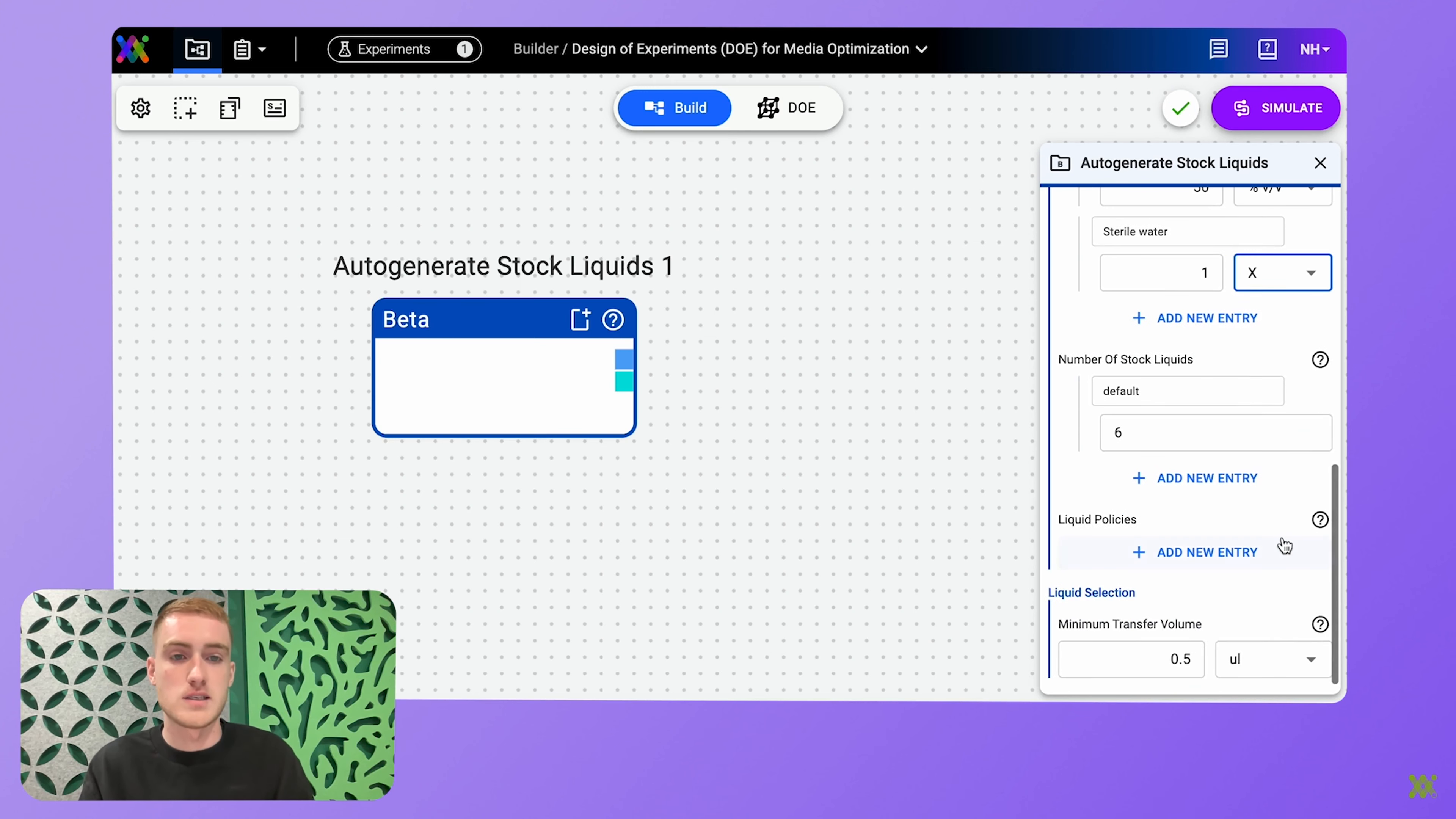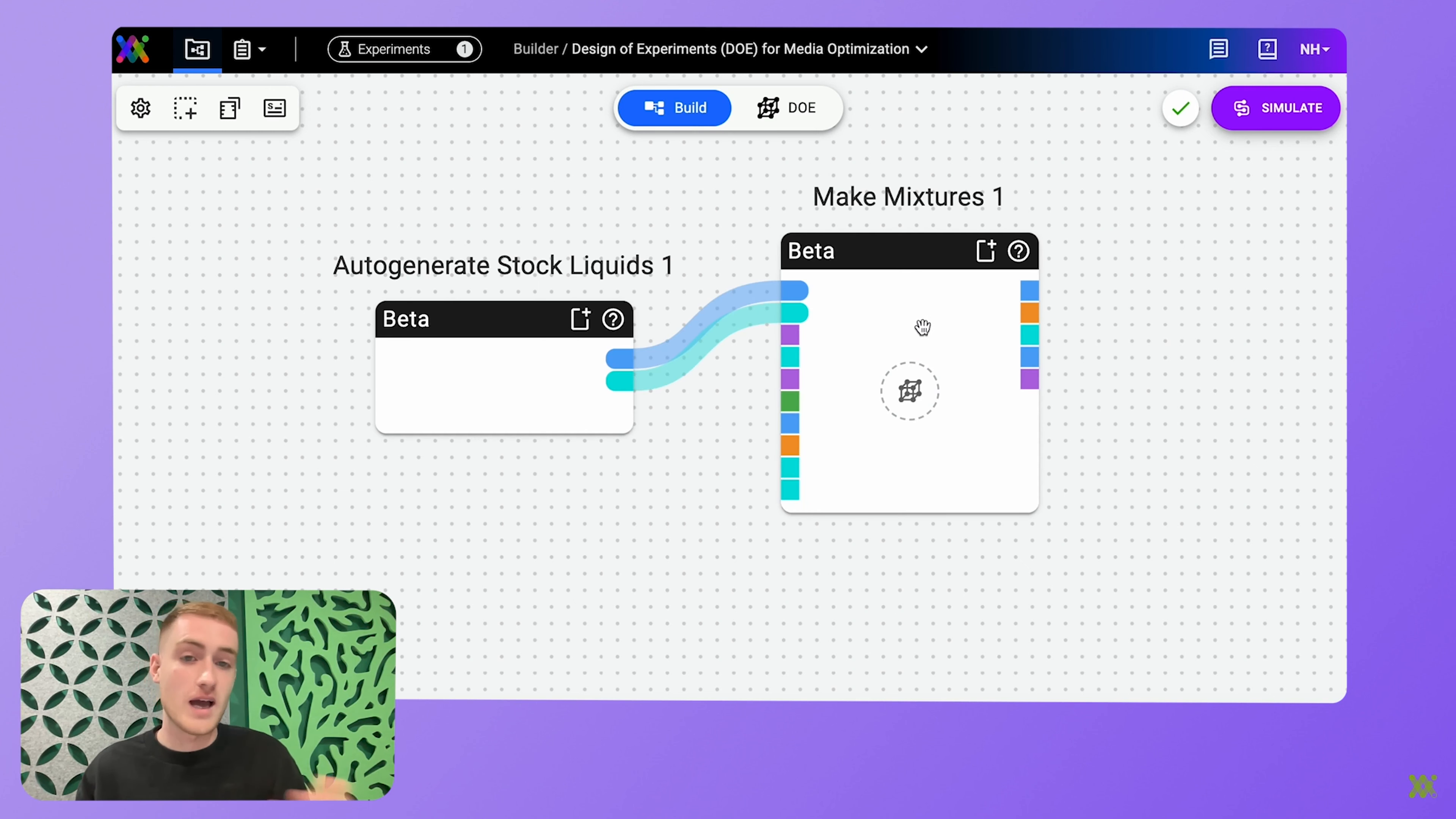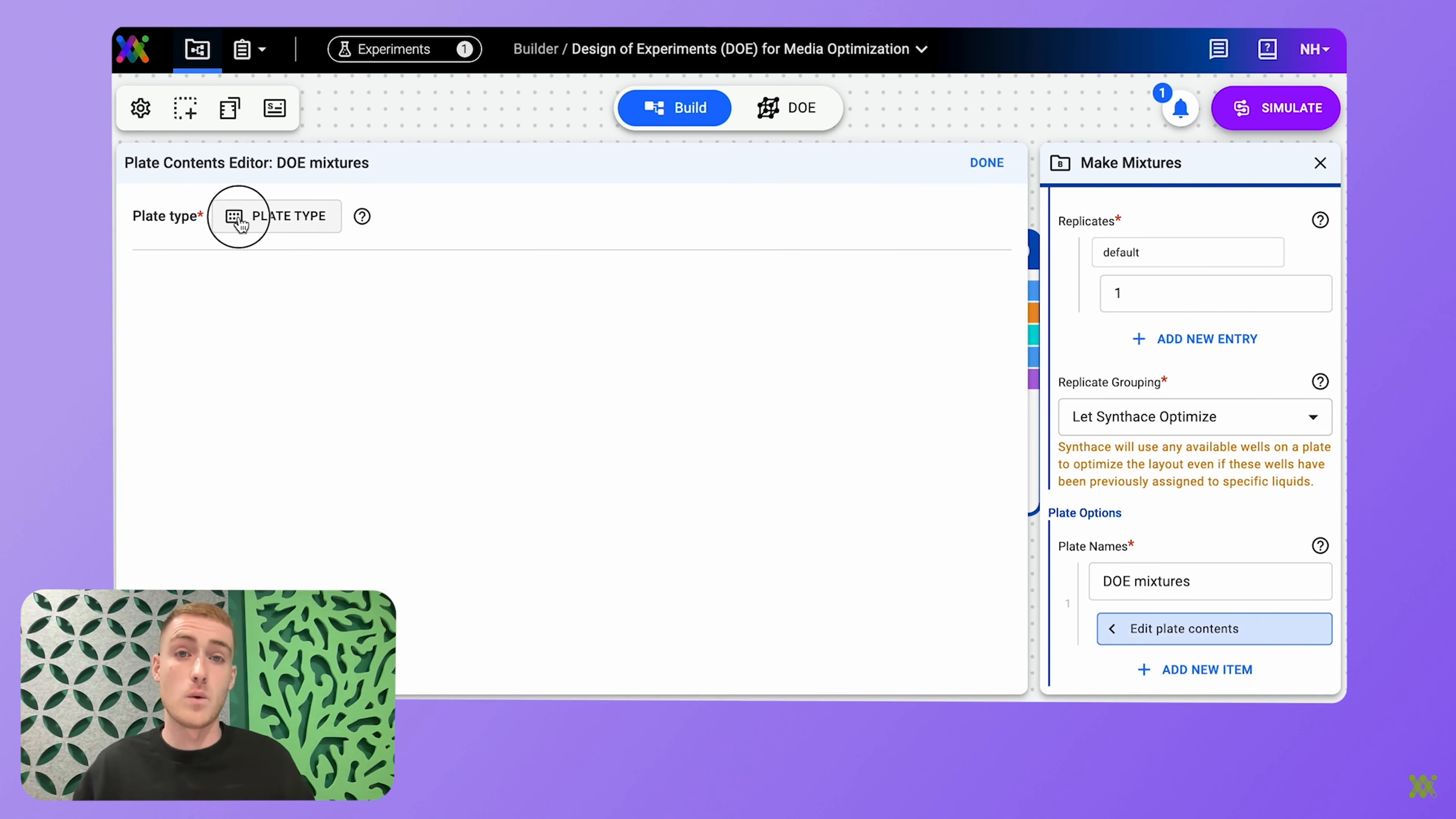I'm also defining sterile water in here, which I'll be using as a diluent. Then I'm connecting these liquids to a make mixtures element, which will make mixtures from my stock solutions and my diluent. And all I have to do is add some extra info, which will tell the element how much volume I want to make, and then tell the sterile water is my diluent and the plate that I want to make the mixtures onto.